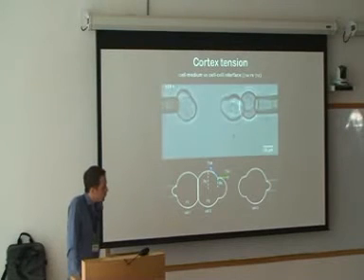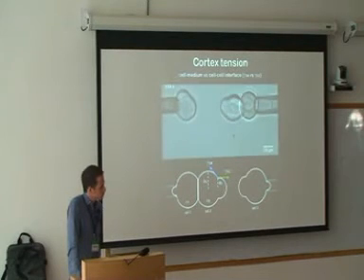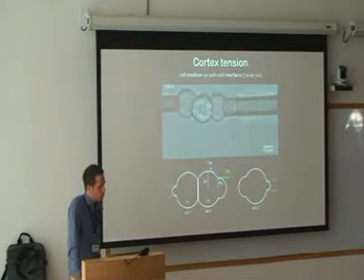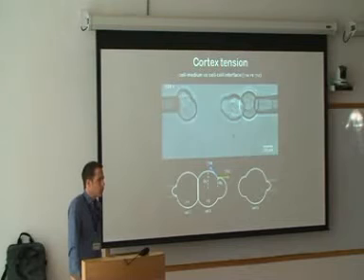Now, instead of holding the cell in the pipette, you could just stick a cell on a rod. And then pulling on them? And then just pulling the other side. Because now, in this case, you don't really care about how much you aspirate the cell. Yes, I mean, in principle, you do nothing else in an AFM experiment if you would separate cells.